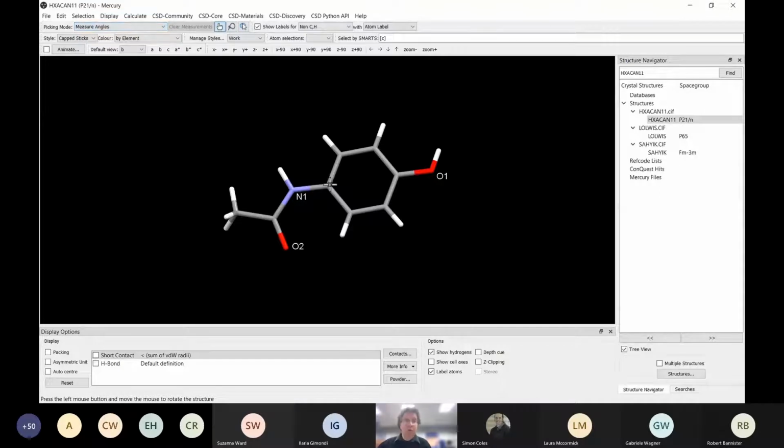Of course, we've got distances. We can also do angles. So let's do that atom. There we go. Doesn't matter, but you can get angles, and if you want a sensible angle, we can put them in and so on. And we can do torsion angles as well if we want. So we can measure distance, and as I say, we're not just doing simple bond distances. We can do any two atoms for a distance, any three atoms for an angle, and any four atoms for a torsion, as long as you do them in a particular order. I'm not happy with that measurement, so we'll do clear measurement.